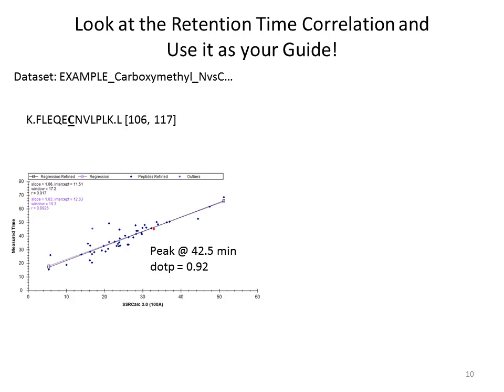So retention time is another way that we can make sure that we're picking the right peak. Now, Lindsay will go into retention time this afternoon, but the idea here is that peptides are made up of amino acids. Amino acids have a certain hydrophobicity, which means will they elute early or late in your gradient, right?